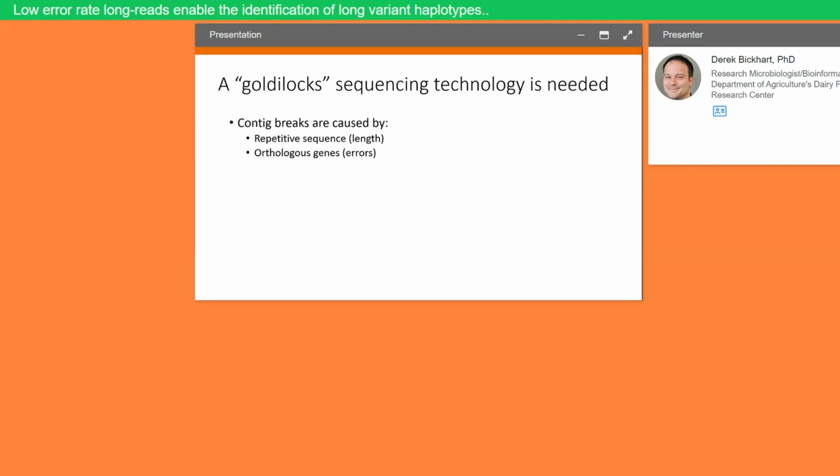However, as I mentioned, DNA sequence cannot typically be used to form an entire contig, and much of this is because of errors or issues with the complexity of the genome. For example, the read length needs to be larger than repetitive sequence, and because of the presence of orthologous or highly similar genes in different organisms, you need highly accurate reads in order to identify and distinguish them.